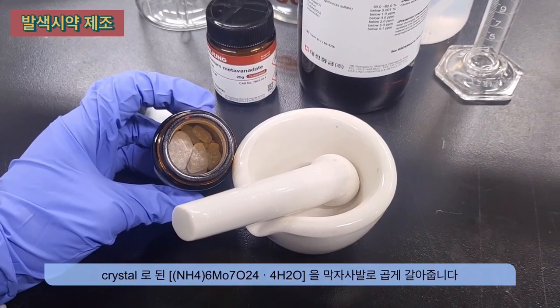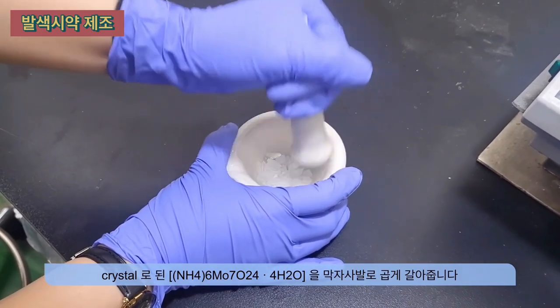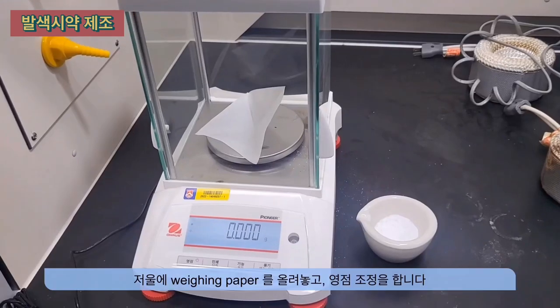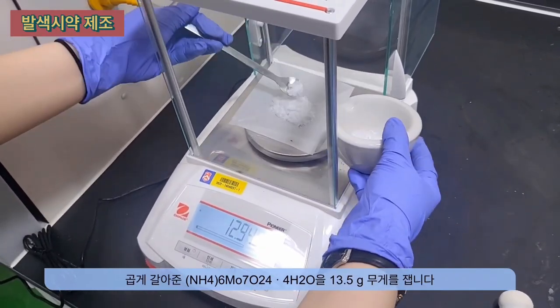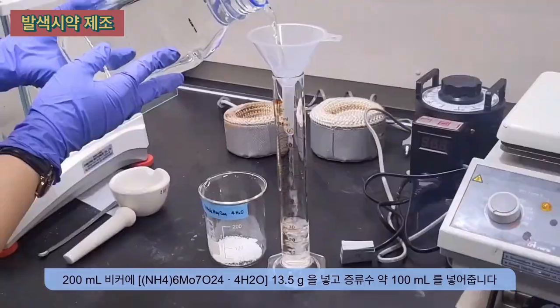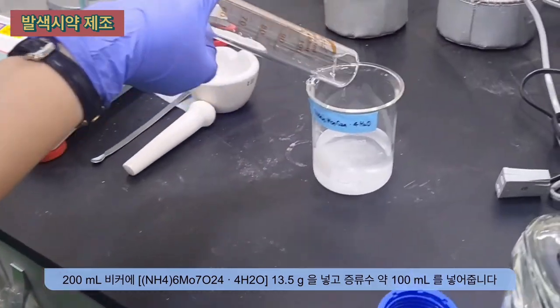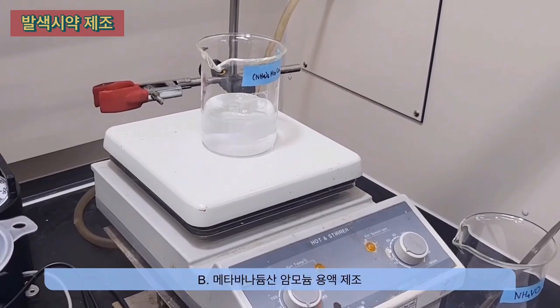Grind the ammonium molybdate tetrahydrate crystal into a fine powder using a mortar and pestle. Place weighing paper on the scale, close the door, and perform zero calibration. Weigh 13.5 grams of ammonium molybdate and place it into a 200 milliliter beaker. Add approximately 100 milliliters of distilled water and dissolve it using a stirrer.